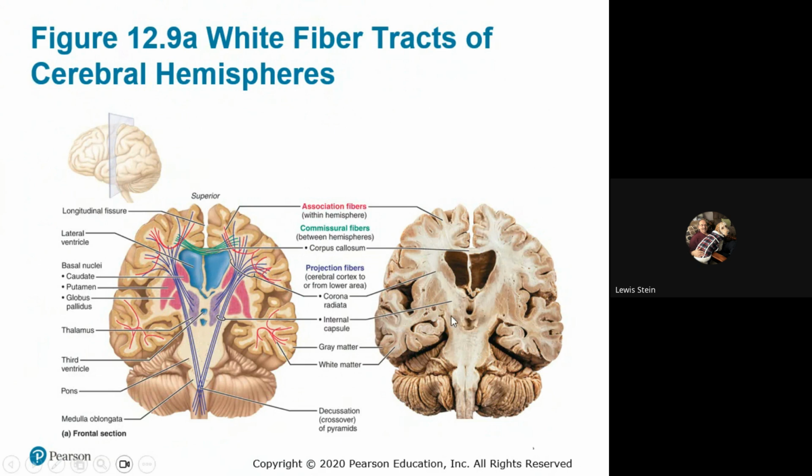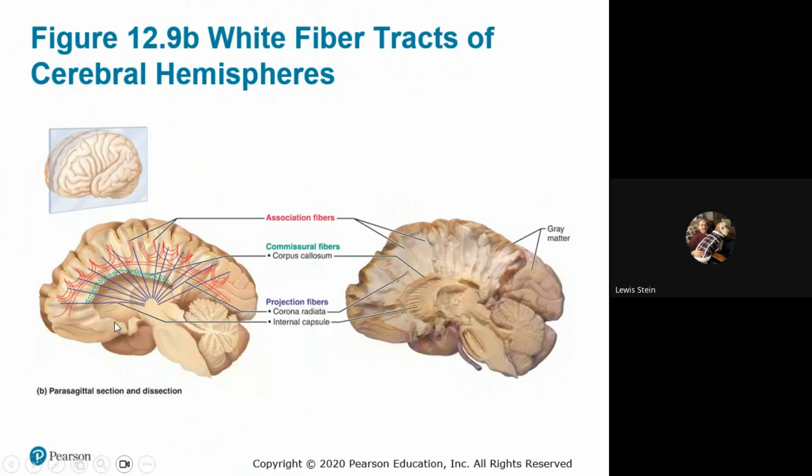And again, these are the thalamic areas we're going to come to in a second, and that would be like the corona radiata, part of it. So you see better from this view. See, this kind of looks like a shell, like a seashell. That's that corona radiata portion of it. The thalamus would be in here, and then here's the rest. And you can see the orientation. Our frontal lobe is much more substantial. The sheep's is hard to tell, not as distinctive.